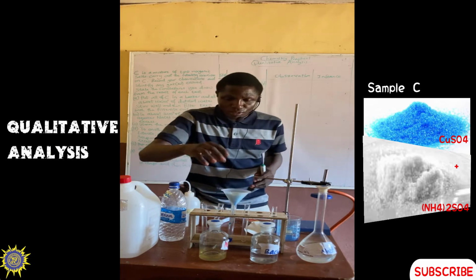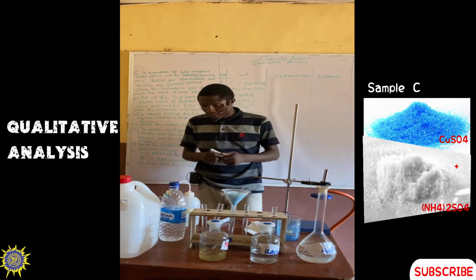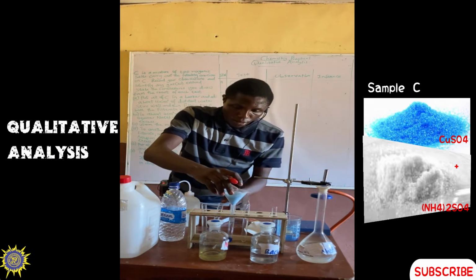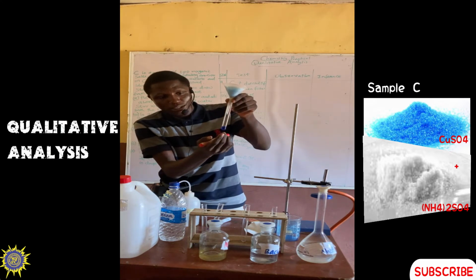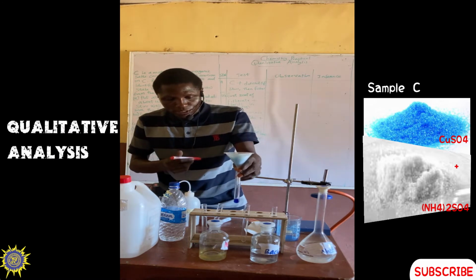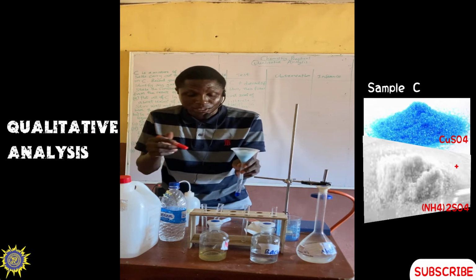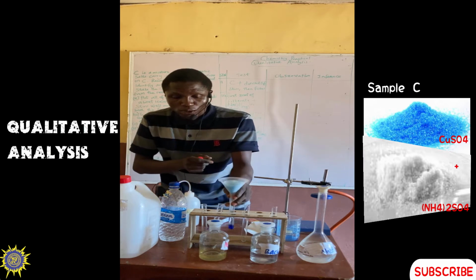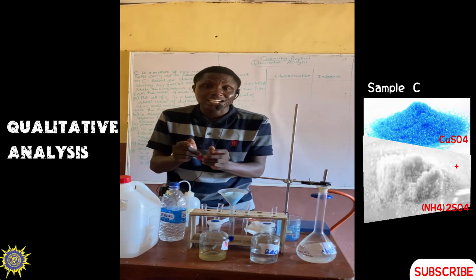Now let's look at our filtration, which is still going on. While we are still waiting for it, let me get a marker. You can see we have the deep blue filtrate here. The residue that we are going to have there is a little bit lighter than the blue filtrate. So I want to have blue filtrate, deep blue filtrate, then light blue residue.